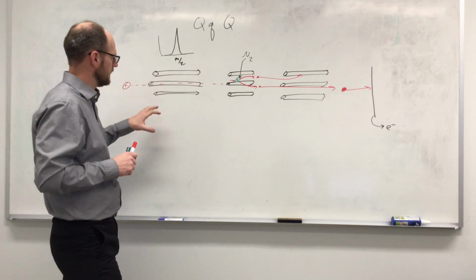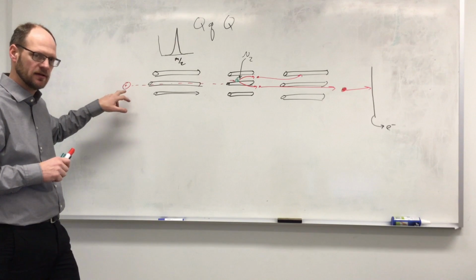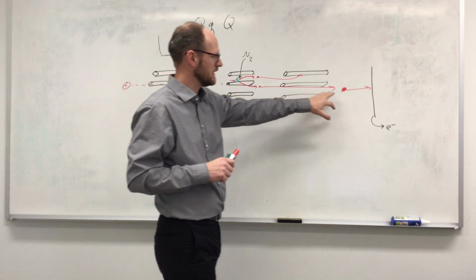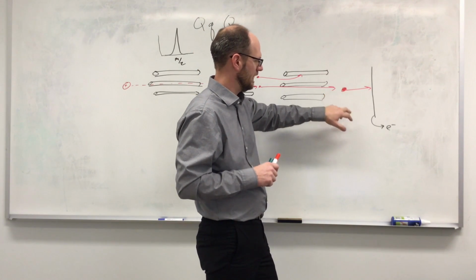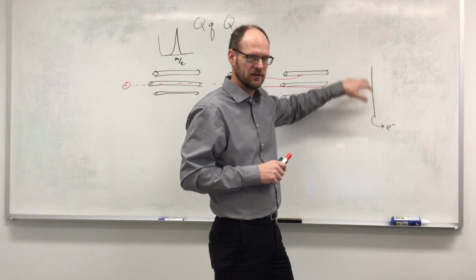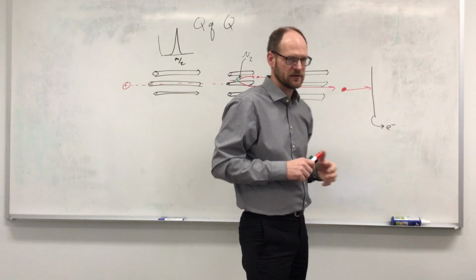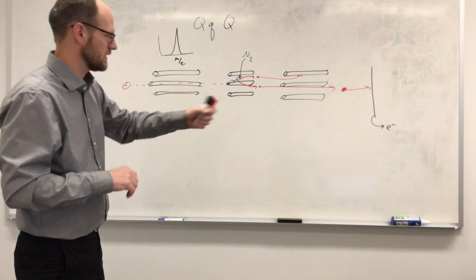And you use this instrument typically by selecting for a particular parent mass, fragmenting it, and then isolating a particular fragment or product mass, and you detect it because it smacks into a metal plate that induces an electrical current that you can detect. That is how a mass spectrometer works.